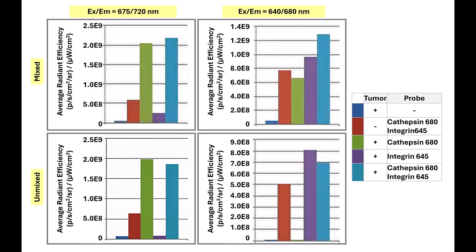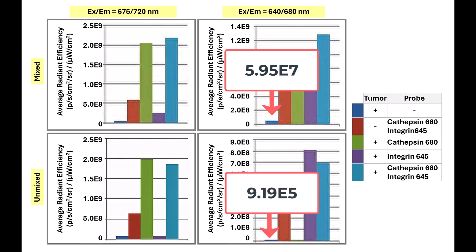For our analysis we will compare data before and after unmixing. To circumvent the necessity of spectral unmixing you would need near background signal intensity in control animals when the non-specific filter pair is analyzed. For example, we want to see levels close to the autofluorescence background in mouse number 3 when the 640-680 filter pair combination is used, and background levels in mouse number 4 when the 675-720 filter pair is used. This would indicate low crosstalk. However, you can see that before unmixing there was significant bleed through of both probes. Spectral unmixing will correct for this. After unmixing, the signal bleed through has been eliminated. Autofluorescence background signal was also reduced after unmixing from 5.95e7 to 9.19e5.